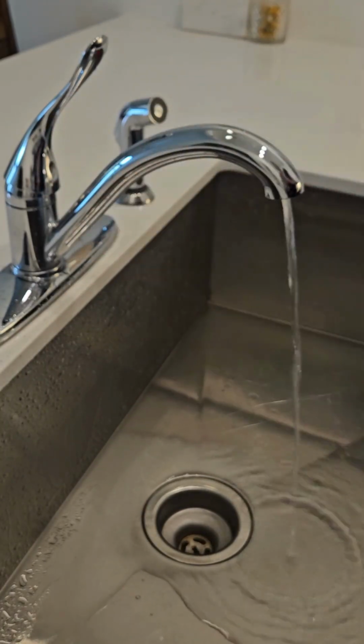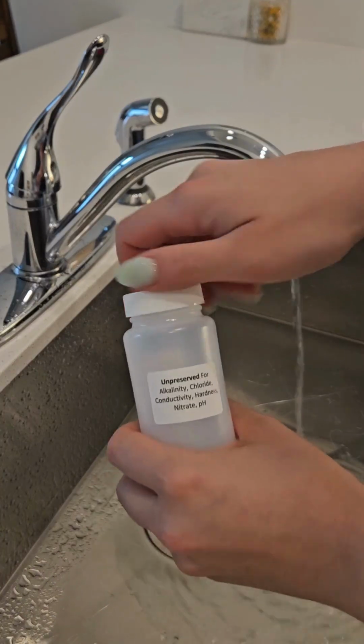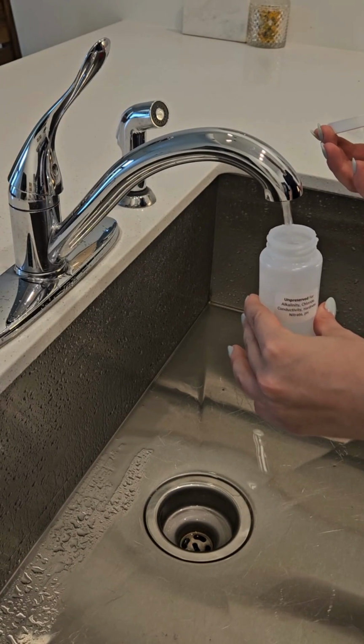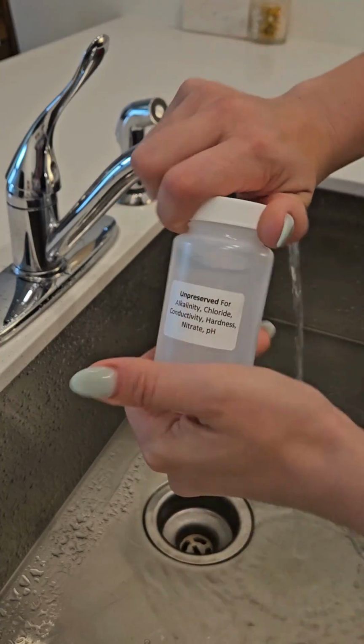Leave the water running at the slow trickle to collect the second portion of the homeowner sample. Carefully remove the cap of the second homeowner package bottle and fill to within a half an inch of the top and then securely replace the cap.